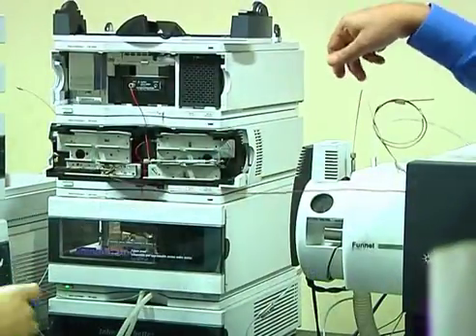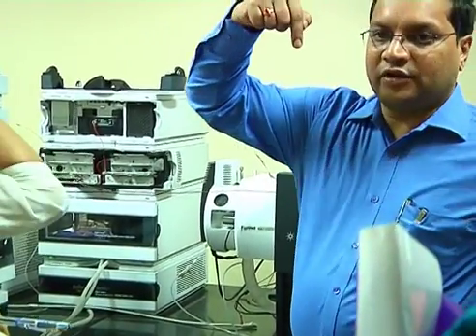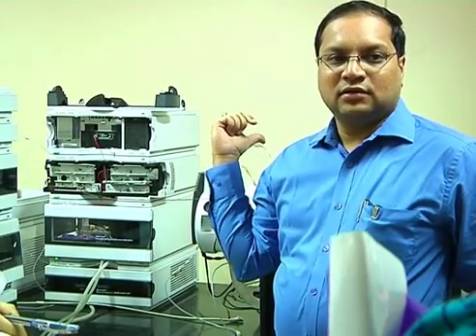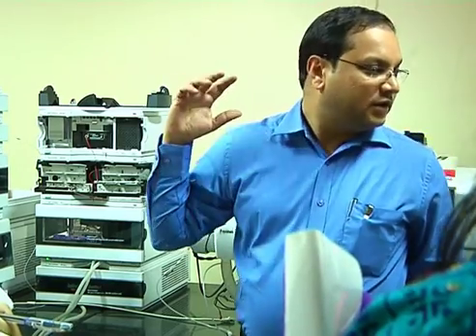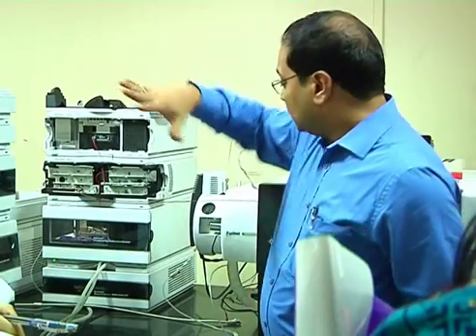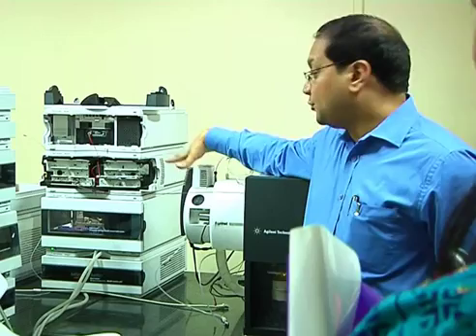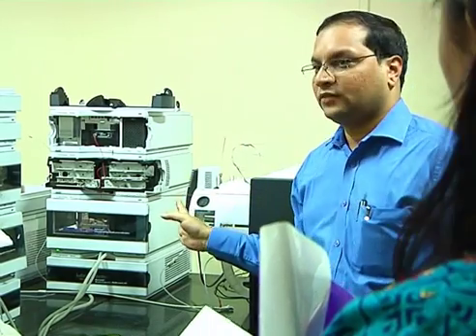As you see, what is the output here? It's a stream of liquid. But what does the mass spec measure? Mass, ions. So the language it speaks is not understood by this liquid right now. We need a device which converts this liquid into ions. That is the role of an interface, also called an ion source or atmospheric pressure ionization technique, and one type of atmospheric pressure ionization is electrospray, which is this.